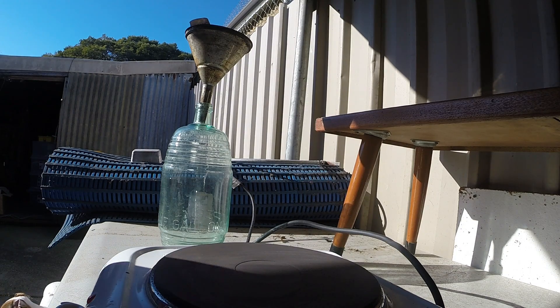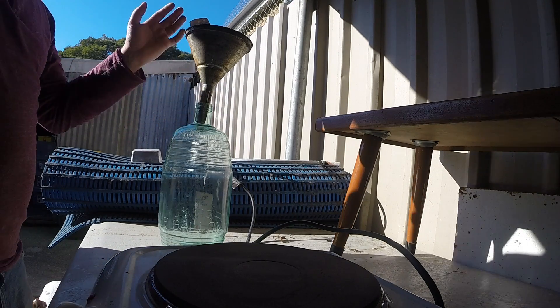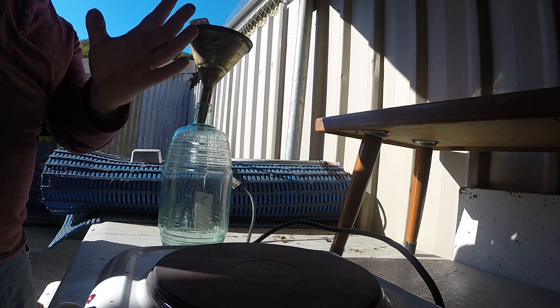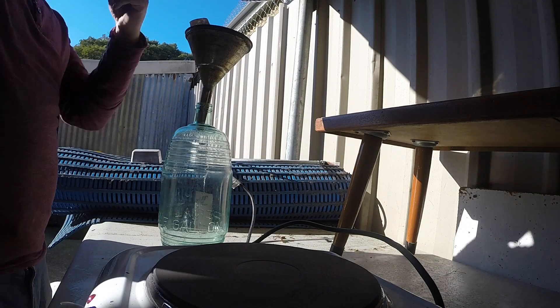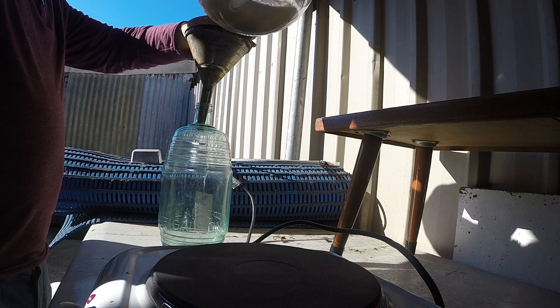Once you've concentrated it down you have to make sure it's stopped up. I think the word is hygroscopic — the sulfuric acid in concentrated form will pull the moisture back out of the air, so it'll dilute itself if left open.